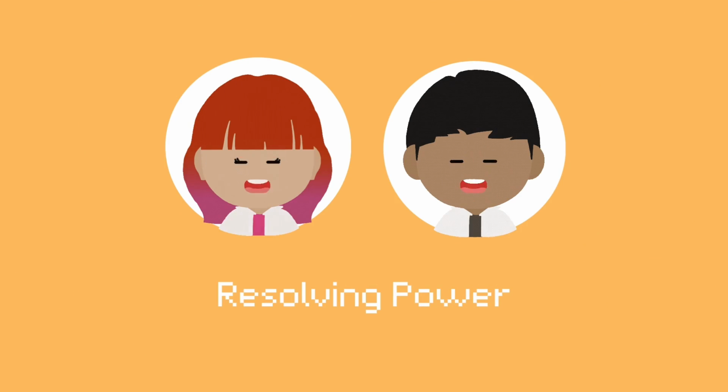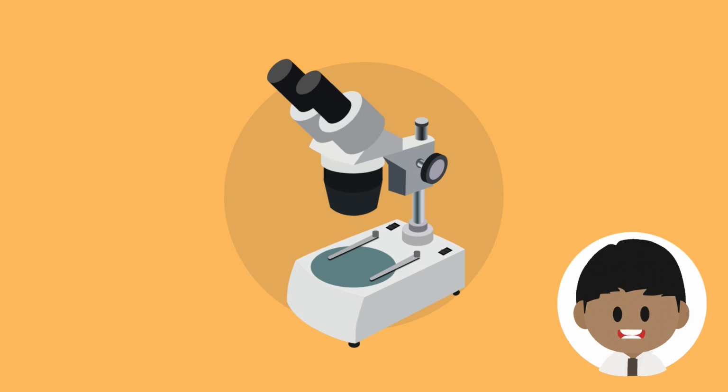Have you ever noticed that even though you've adjusted the coarse and fine adjustment knob, the specimen still appears blurry? This may be due to the lens quality. The quality of lens can greatly affect the visibility of the image.